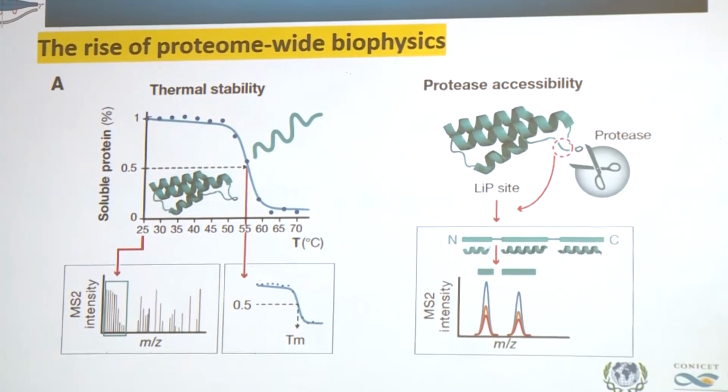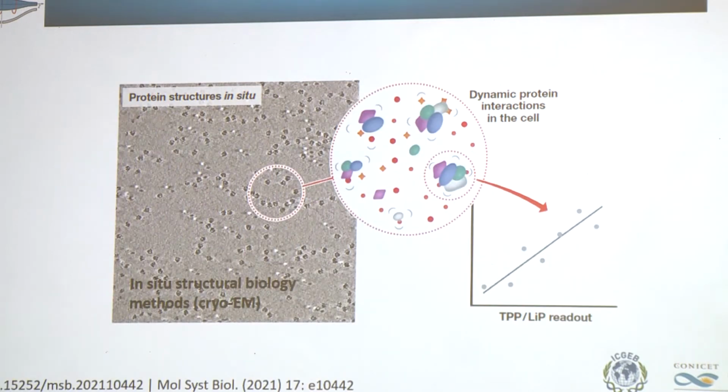This is a recent small review, checking the possibilities, saying that you can compare LiP-MS mass spec and the thermal stability from the same proteome, and integrate both data, and even more with some of the great analytic possibilities, like cryo-EM.